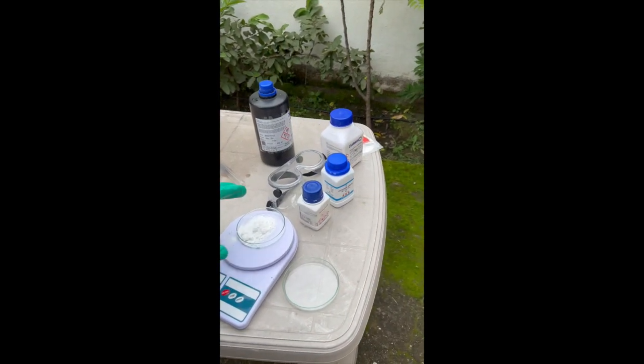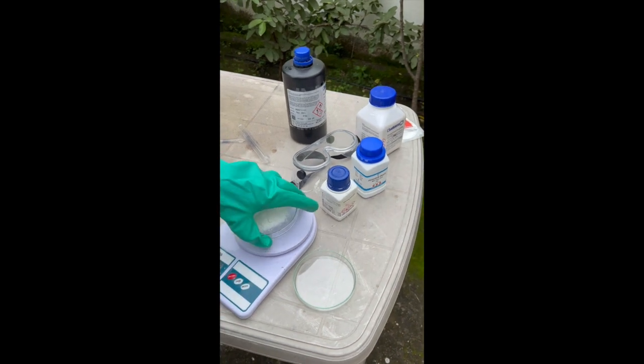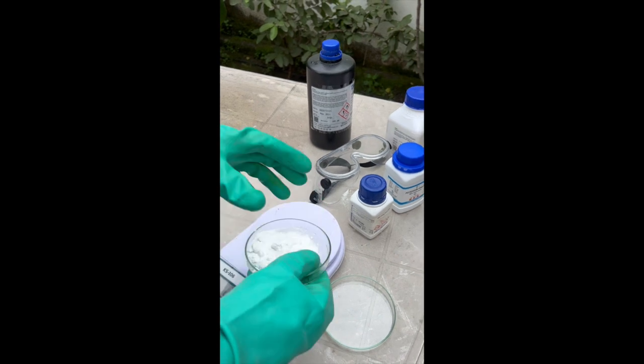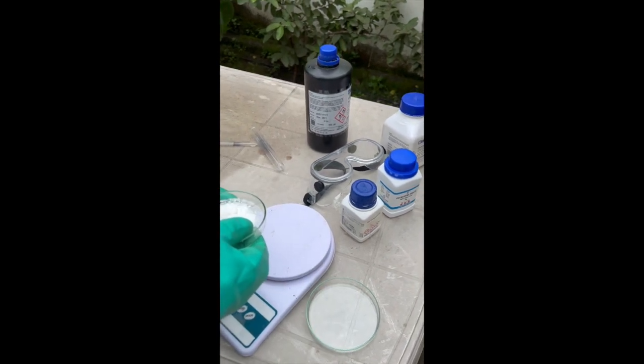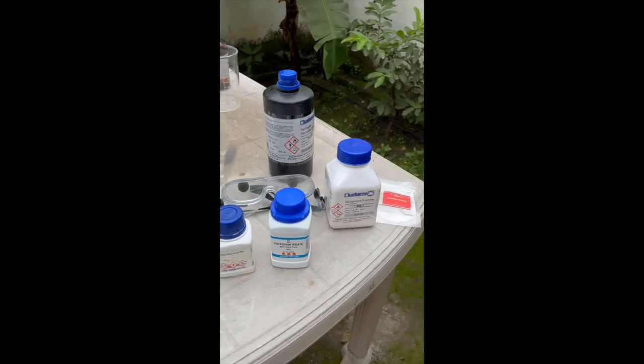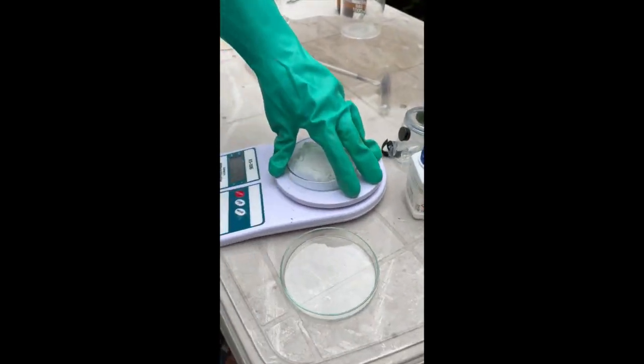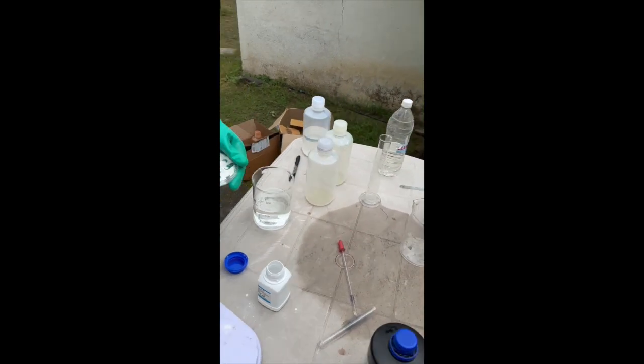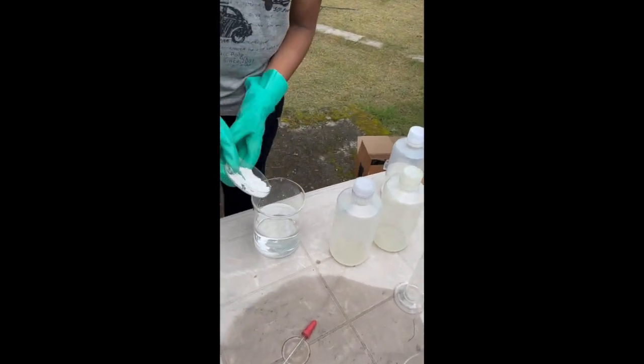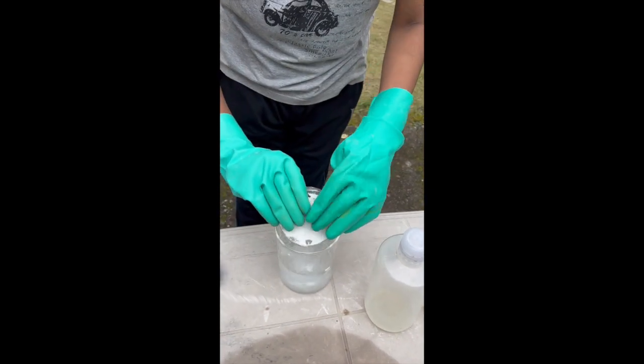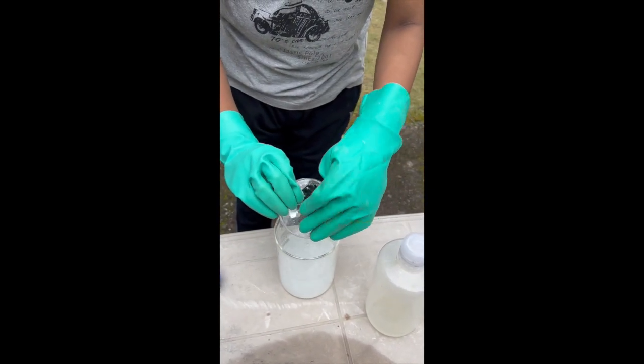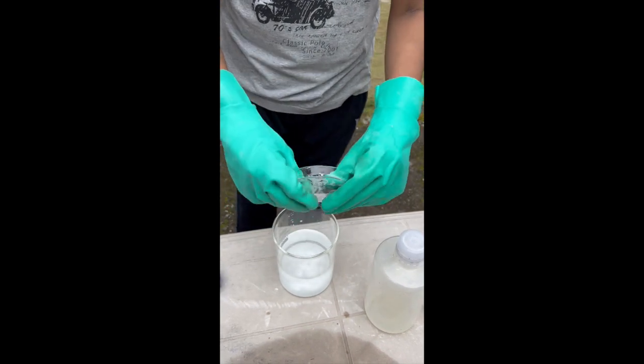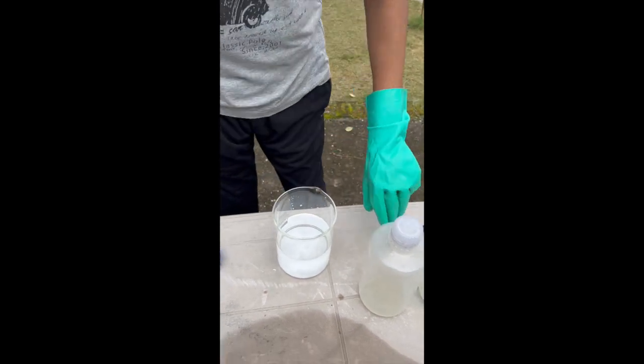For solution B, we require potassium iodate. So, I am measuring it. I want 21 grams, but the kitchen scale is very inaccurate. So, I might have to just trust my instincts and go ahead with it. To a beaker with 498 ml of distilled water, I will add 21 grams of potassium iodate.